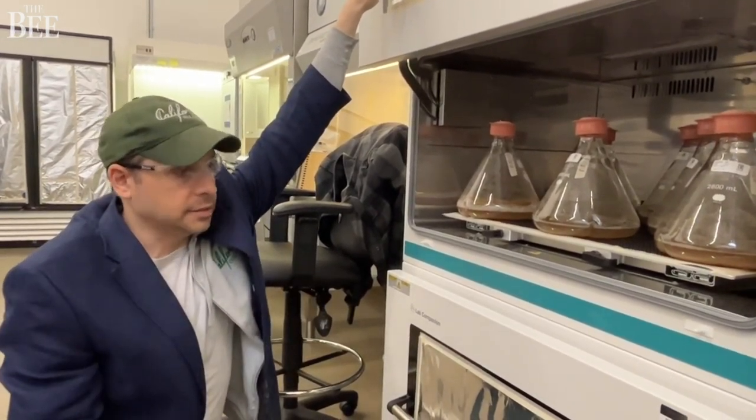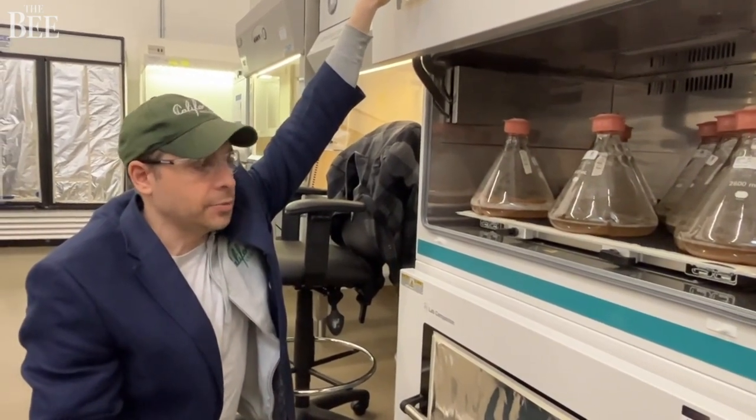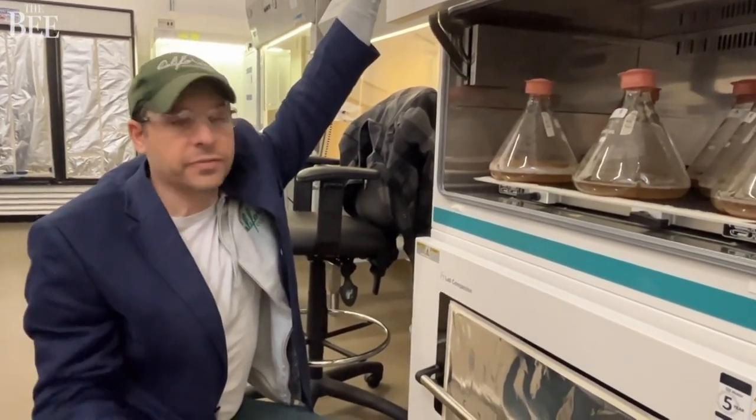This is the largest selection scale that we have. And from here they go into larger reactors, which we're growing for mass and for flavor.